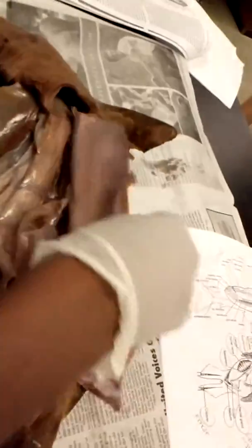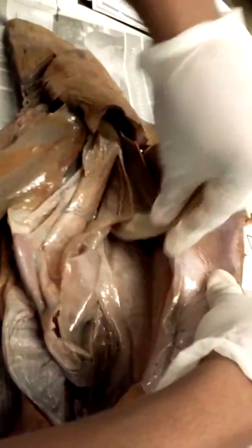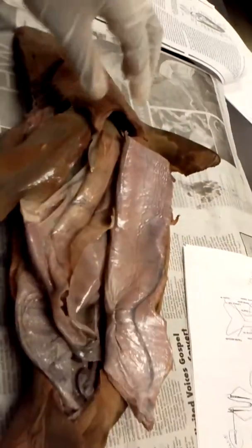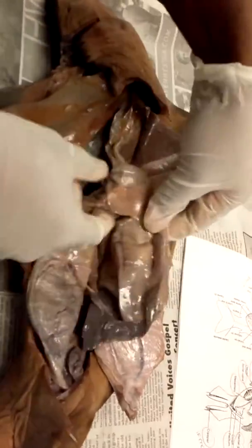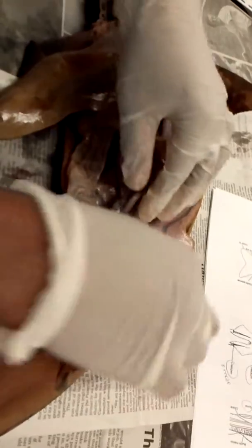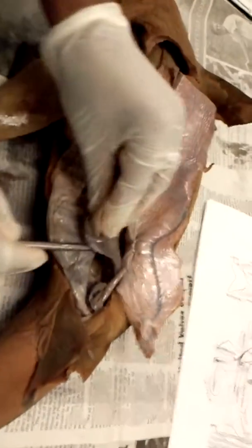This is the liver. This is the right lobe and this is the left lobe. This is the gallbladder. This little thing right there is the pancreas. This little thing right there is the rectal gland. This is the spleen.